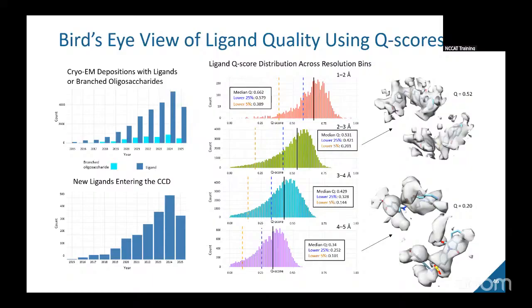But I hope this kind of thing will be out there for people to use, because it is an issue. Especially if in your structure you have several ligands, it may not be one that is interesting to you in the story you tell. But you have to remember with any structure, it's like with the spike protein and the glycans, there's a whole field out there that wants to look at just that one thing. And sometimes things are an afterthought, and then it's bad because people will base future experiments on it.